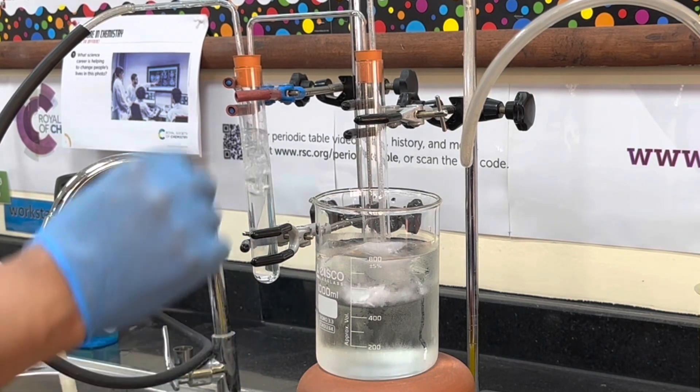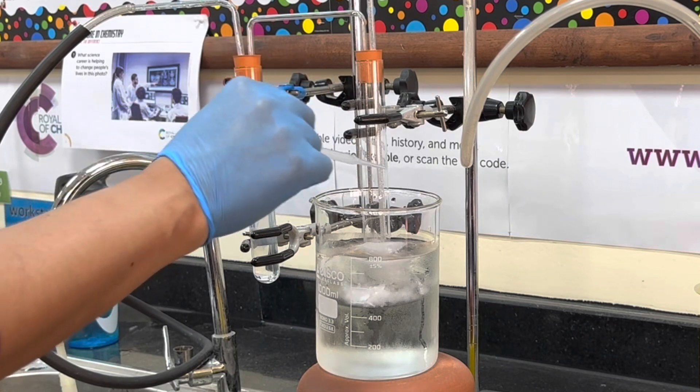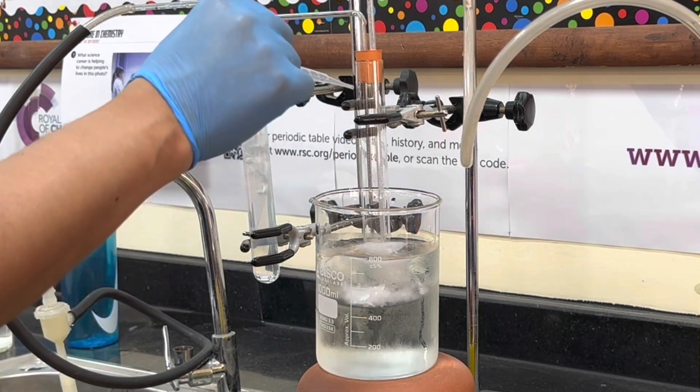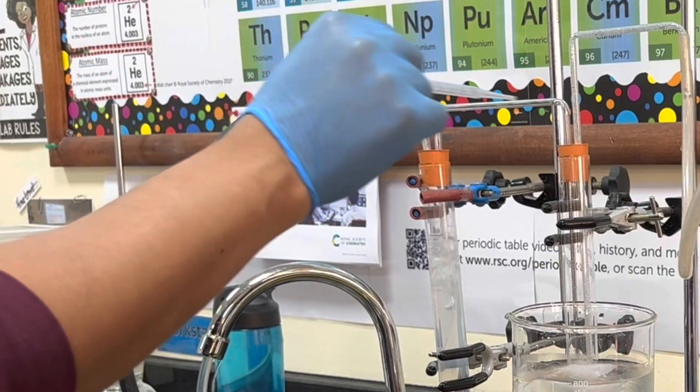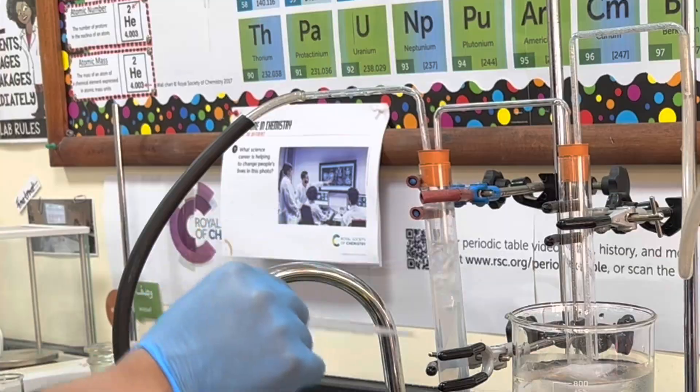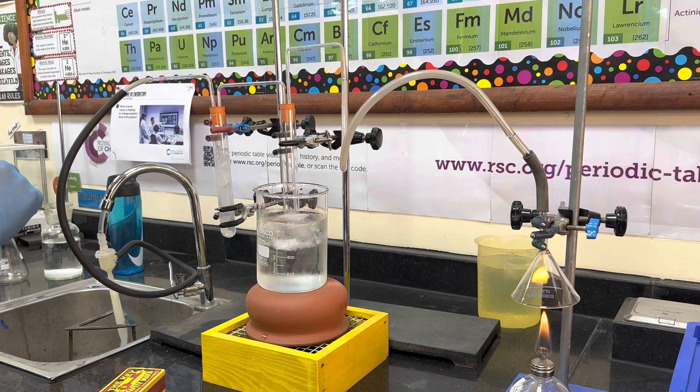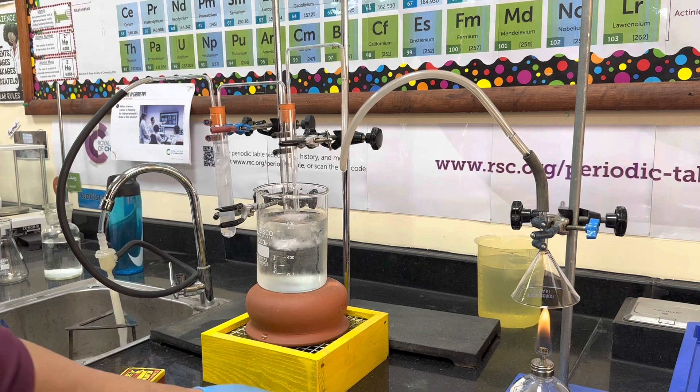You've got some glass tubing with delivery tubes running into a boiling tube that's sealed from the outside. The outside has an ice bath to cool the gases down, and then the gas mixture is passed through some lime water, which we hope will confirm the presence of carbon dioxide.